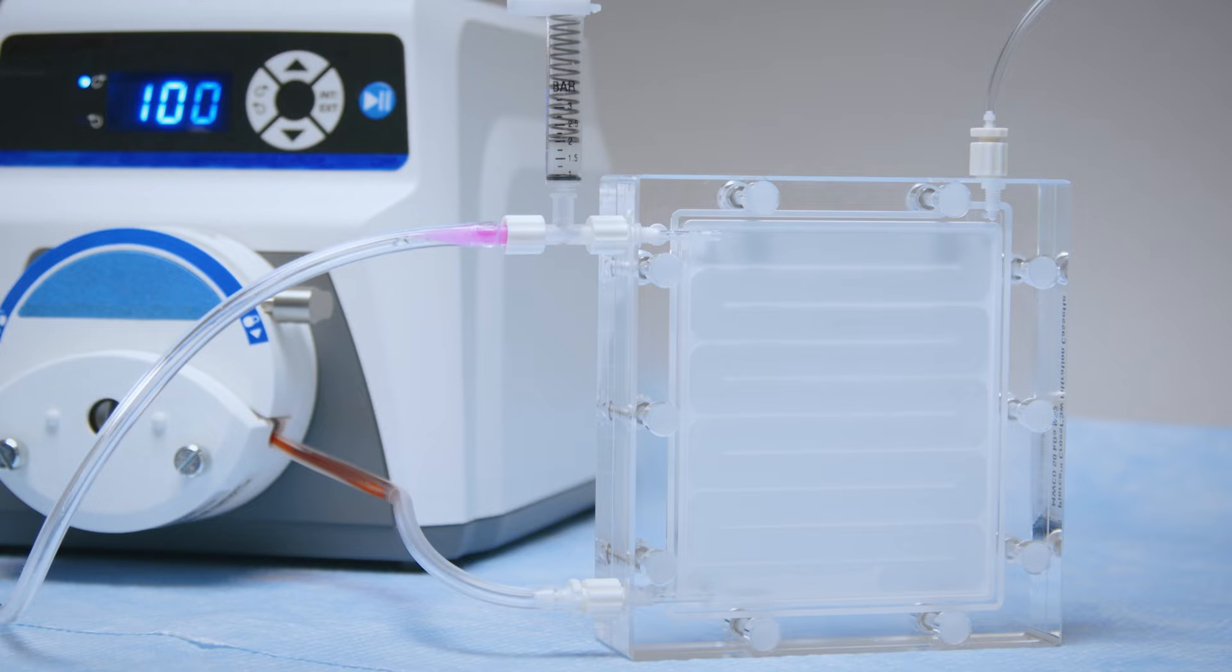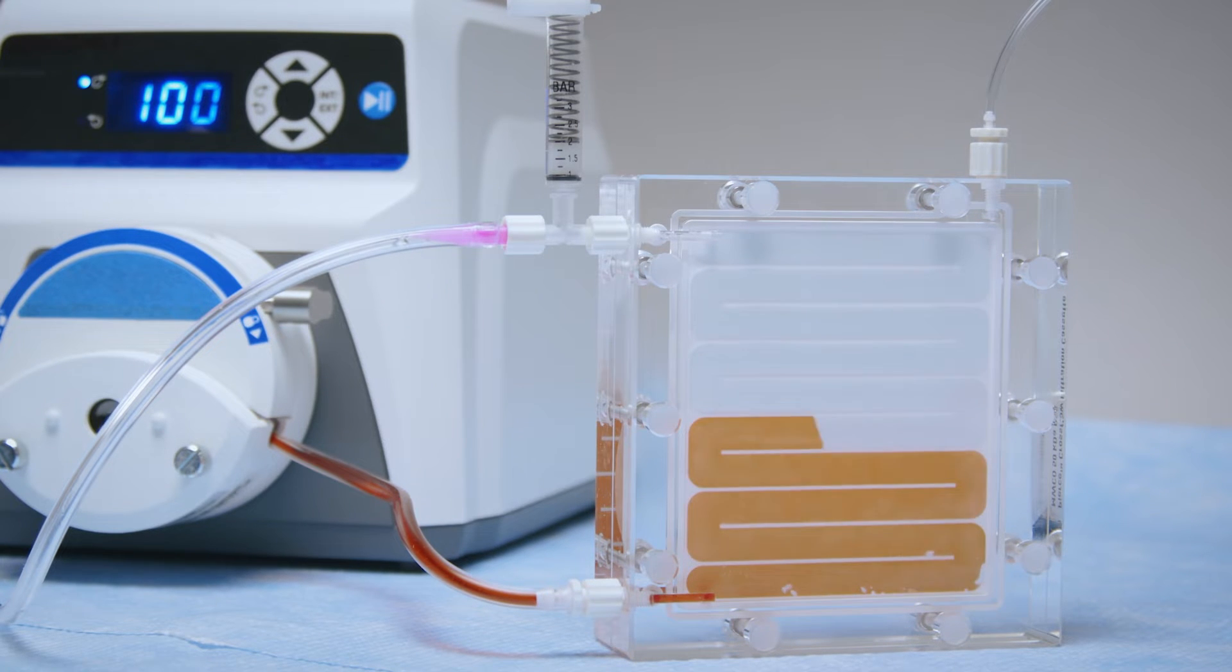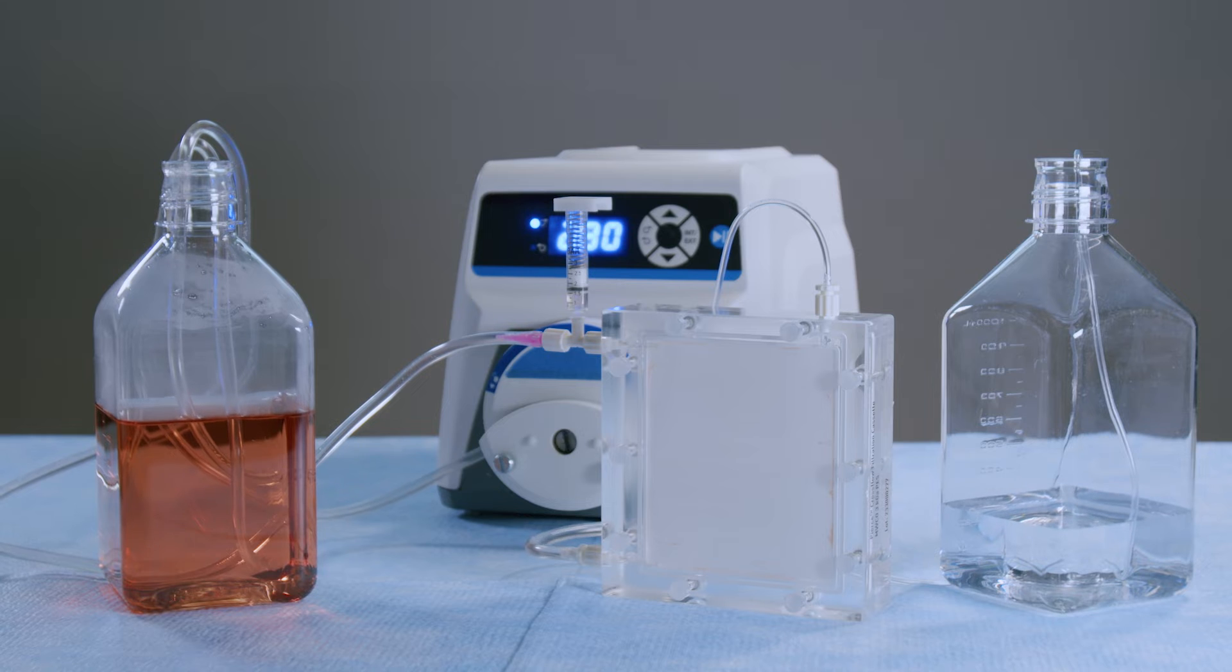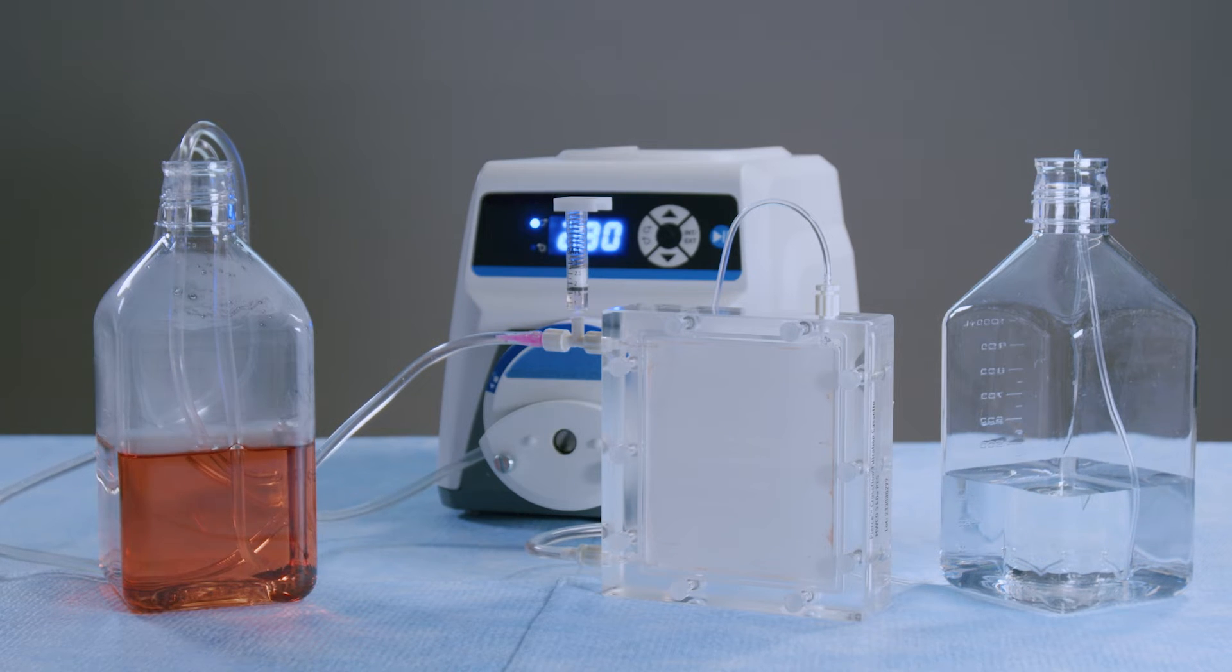The clear design of the CrossFlow cassette allows you to see your sample move through the channels in the cassette as it recirculates and concentrates. Here, you can see the sample color darken as it becomes more concentrated.